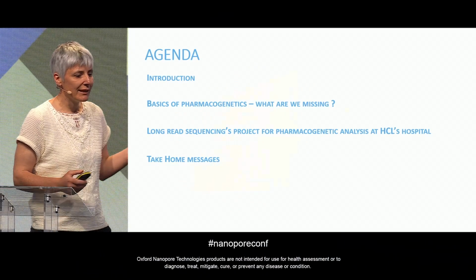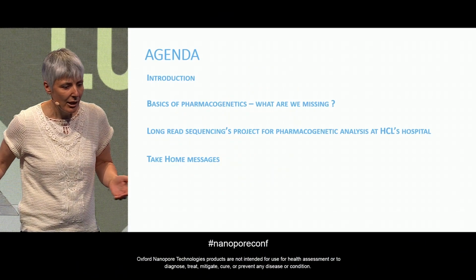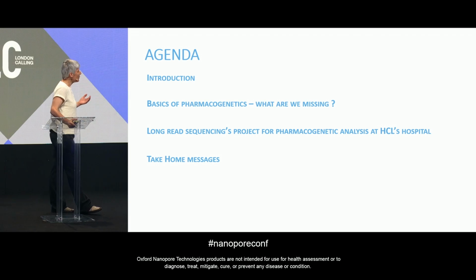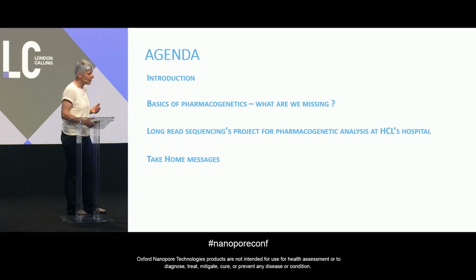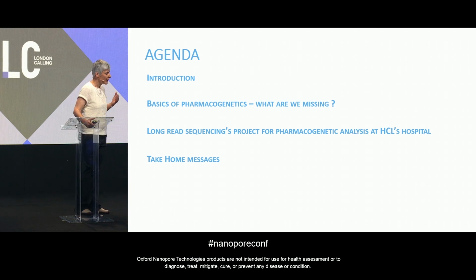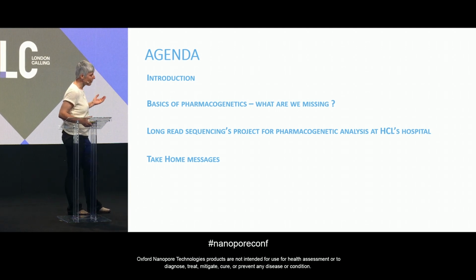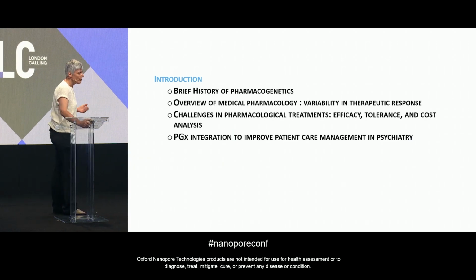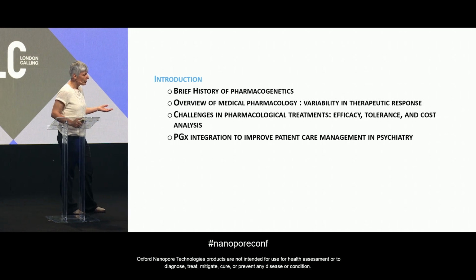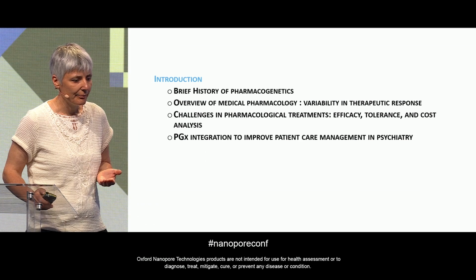and I will follow this agenda. I'm going to introduce the basics of pharmacogenomics to be clear about the topic and to help you understand why we need long-read sequencing and why we tried this long-read sequencing in our hospital for pharmacogenetic analysis. So, a few words about the introduction, the history, the needs, and the challenges we have to face.